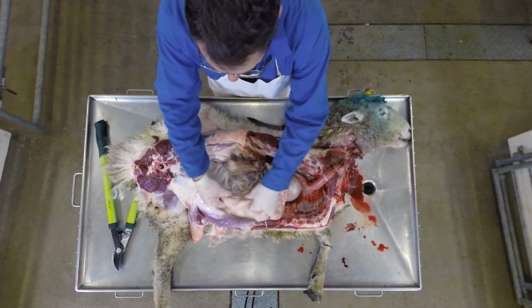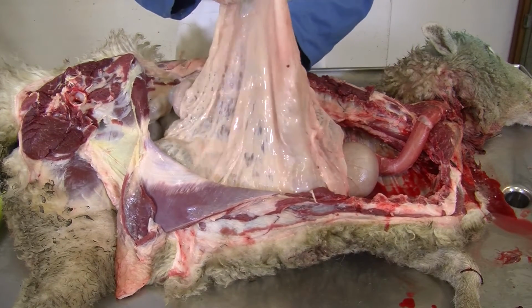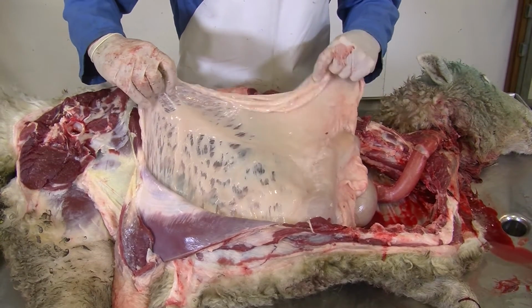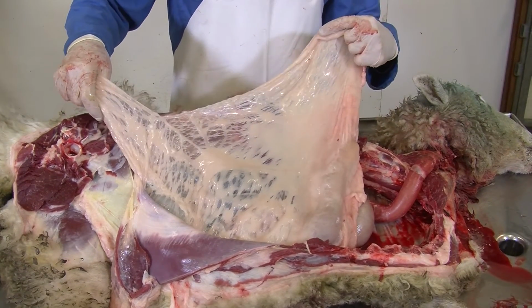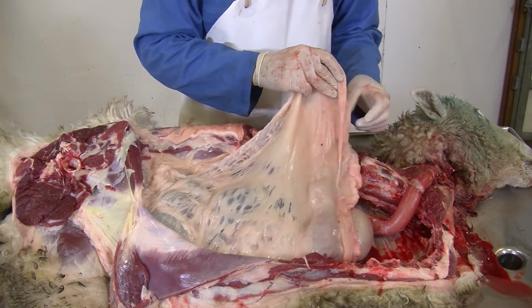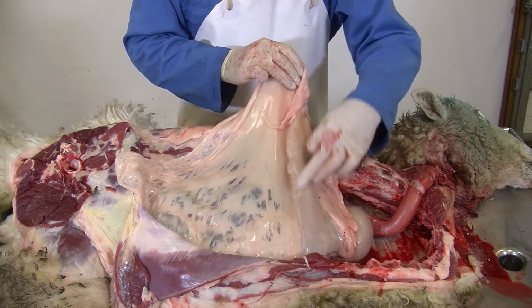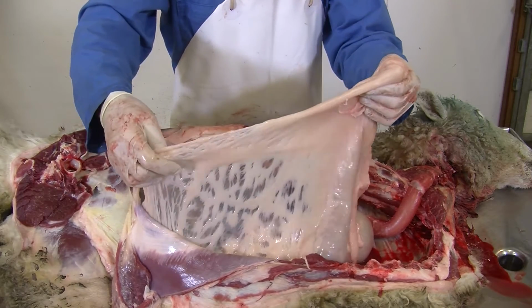Now, here we have a big curtain-like structure which is covered in fat. This is called the omentum, and it's all sort of around the intestinal tract, and it's one of the main storage parts of fat. This animal hasn't got an awful lot, so there's not an awful lot of fat on here. But you can see this here is the last stomach, the abomasum, and you can see how it attaches to the omentum, this fat storage.